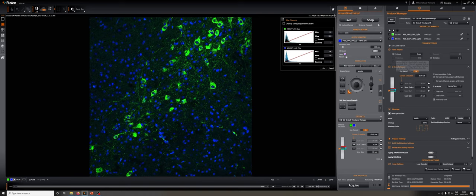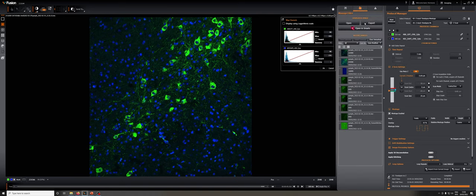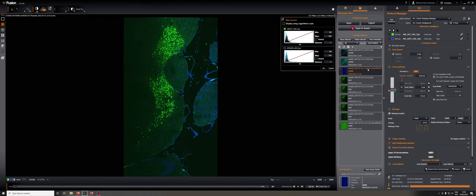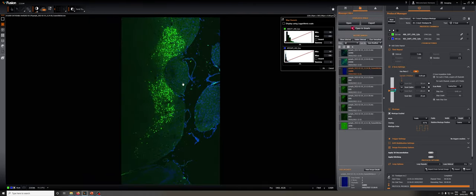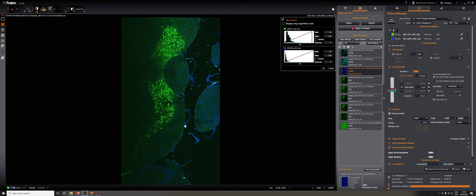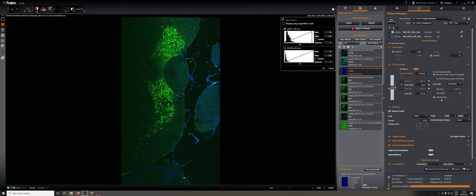So we could, for example, if I go back here and go to this sample, we could take a 3x3 ZStack repeatedly over time by combining all these things.